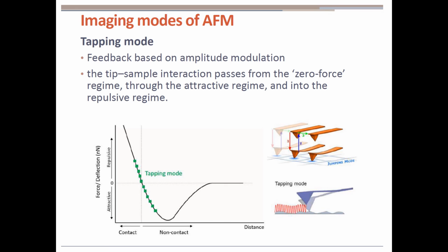So, people developed tapping mode to bypass this problem. Nowadays, tapping mode is the most frequently used AFM mode. In this mode, the cantilever is driven to oscillate up and down near its resonance frequency, and both attractive and repulsion force can be applied. Since the tip can actually touch the surface, the resolution of tapping mode is higher than non-contact mode.